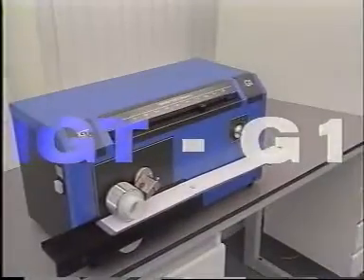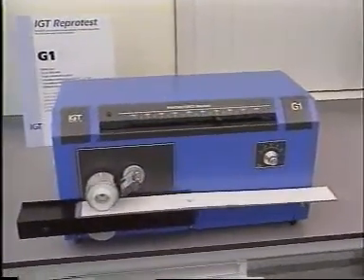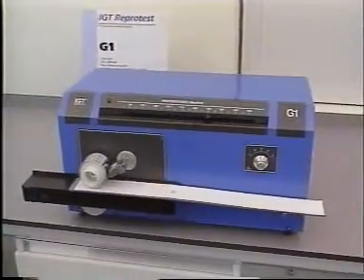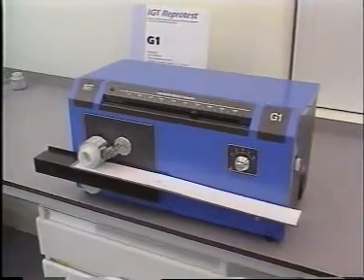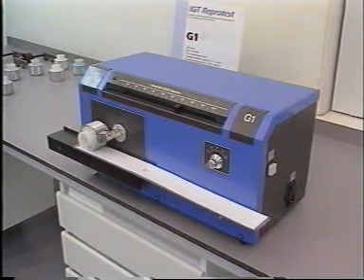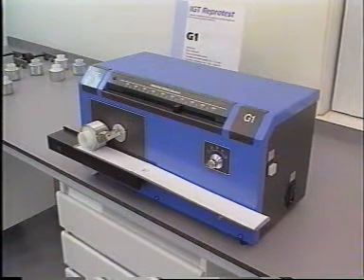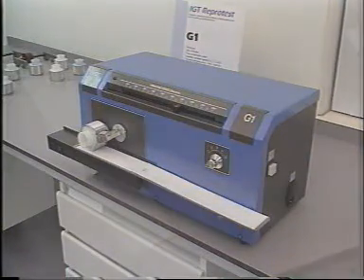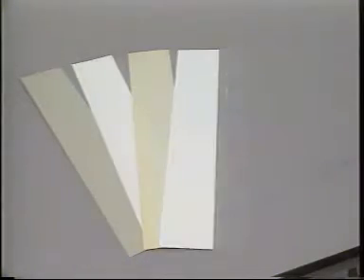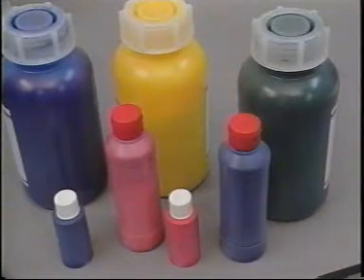The G1 is used to print substrate strips with gravure inks in ink film thickness which simulates actual practice. The prints are used among other things for spectrophotometric or visual appraisal of the colour, to determine gloss, abrasion resistance, adhesion and flexibility of the ink on all sorts of substrate ranging from paper to plastic film. The G1 is suitable for all sorts of gravure inks, both solvent-based and water-based.